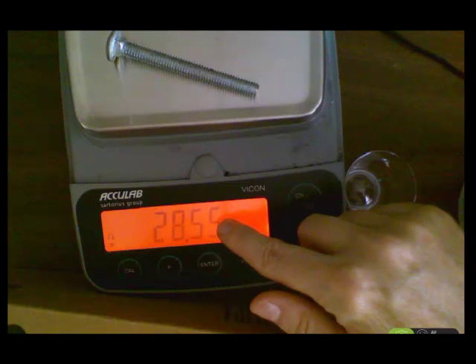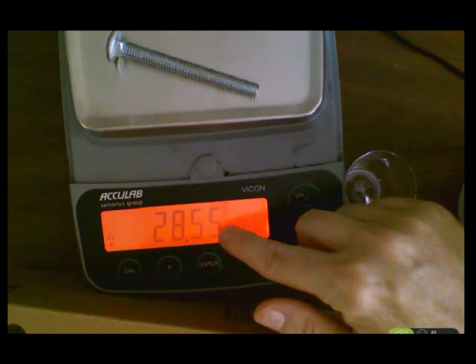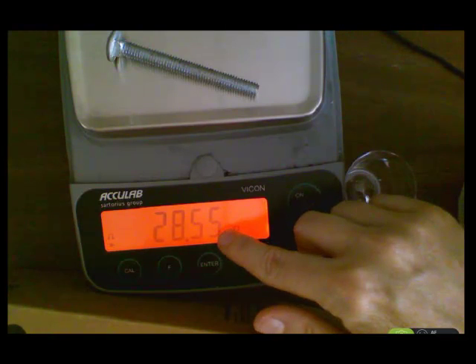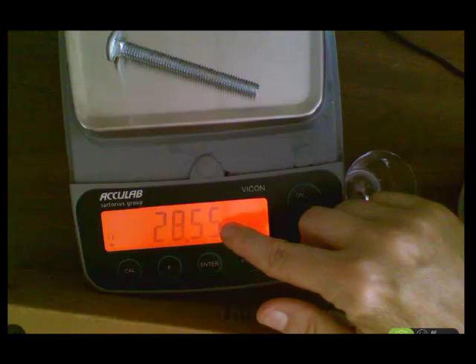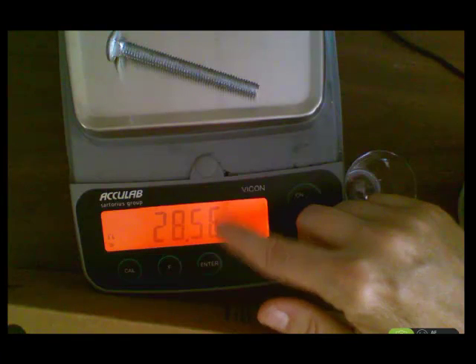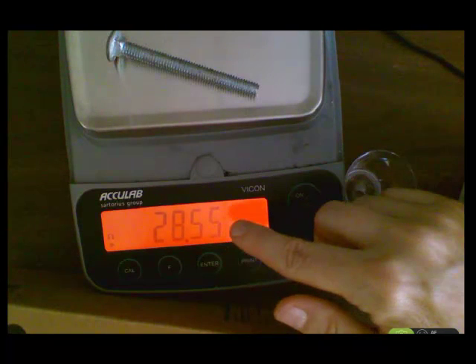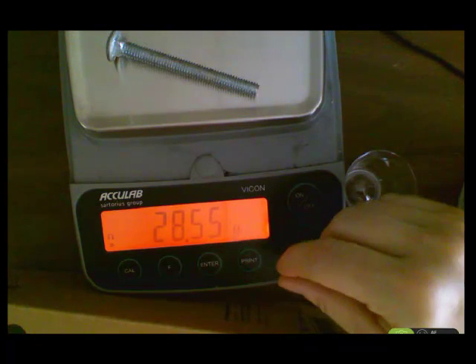We know for sure that the mass of this bolt is 28.5 grams, but we're not 100% certain that the last decimal place is a 5. It could be a 6. There it goes. You see that? It just changed. Or it could even be a 4. So these balances are said to be plus or minus 0.01 grams because that last decimal place is uncertain, plus or minus 1 unit. So keep that in mind later when we start to talk about significant figures.